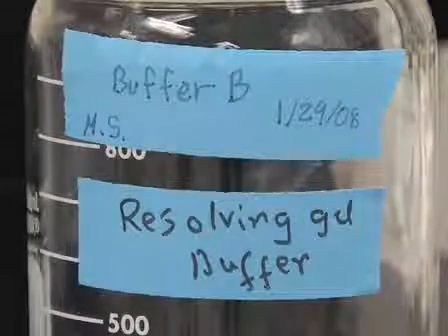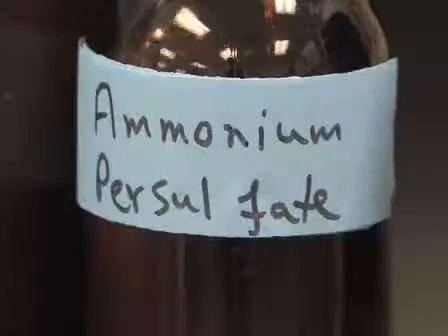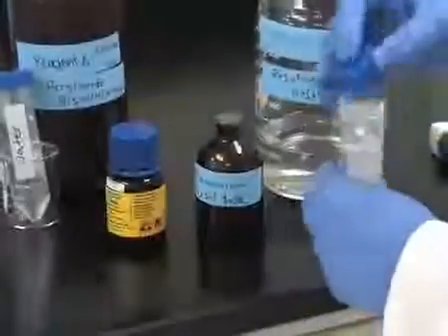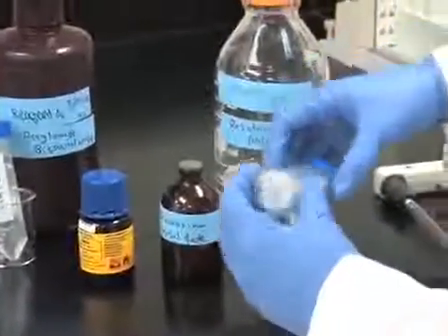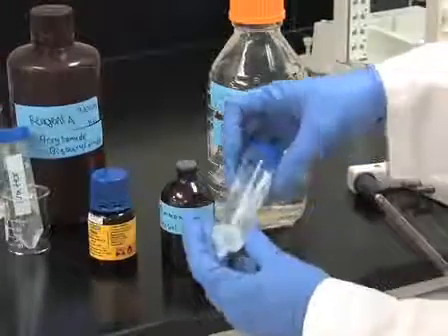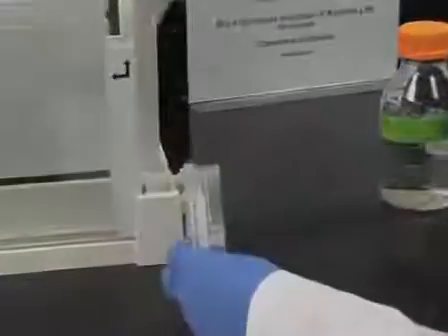Next, prepare the separating gel solution which has been described in current protocols. Add the specified amount of 10% ammonium persulfate and Temed to the solution and stir gently to mix. Due to the high concentration of acrylamide, degassing is not necessary. Using a 10-milliliter disposable plastic pipette, immediately apply the separating gel solution to the sandwich along an edge.